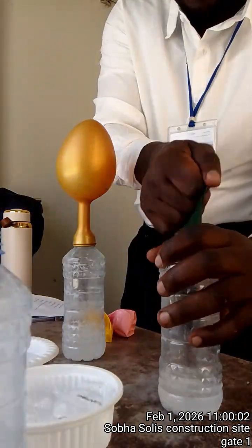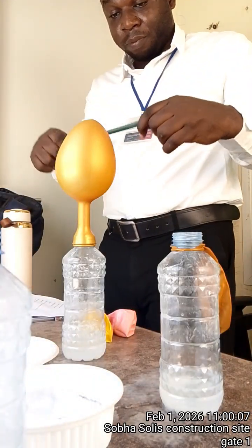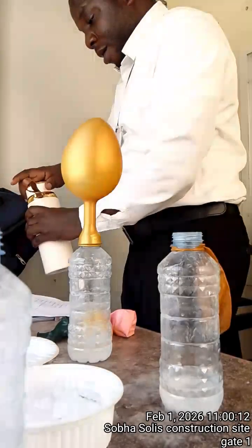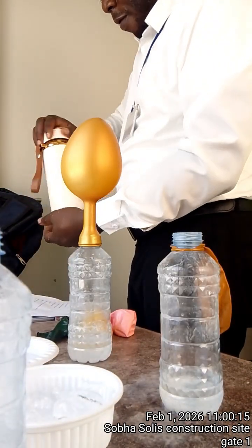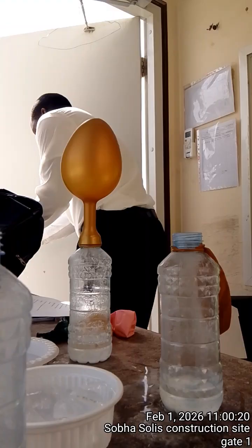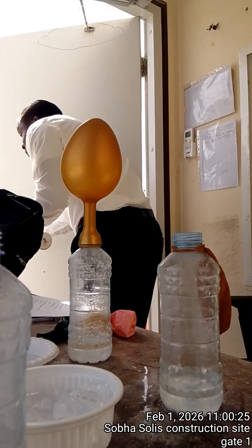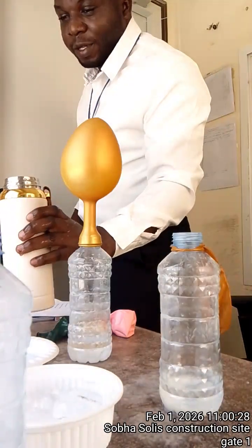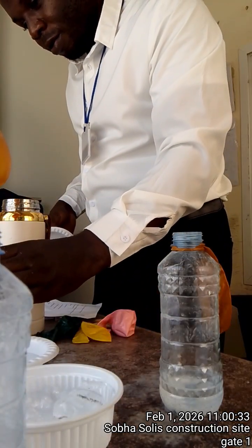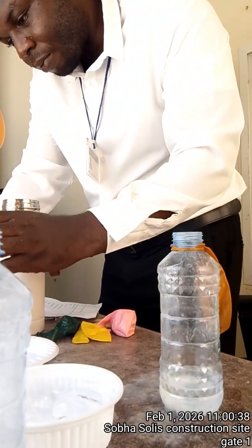Make sure you prevent the leakage or escape. My people, always make sure you have water to rinse in case of contact with any chemical. Don't close your eyes with these vigorous experiments. So after this one, I'll immerse it in warm water.